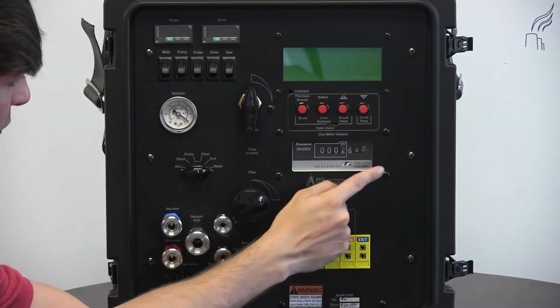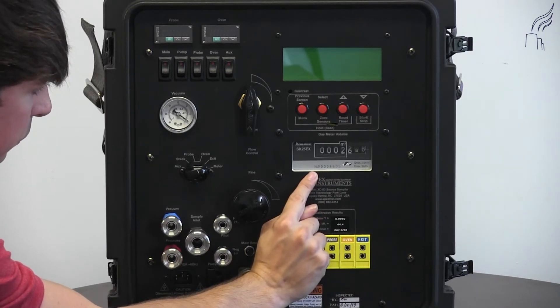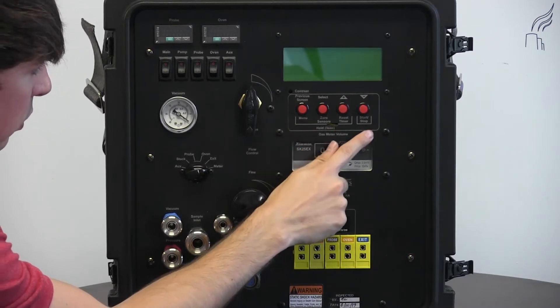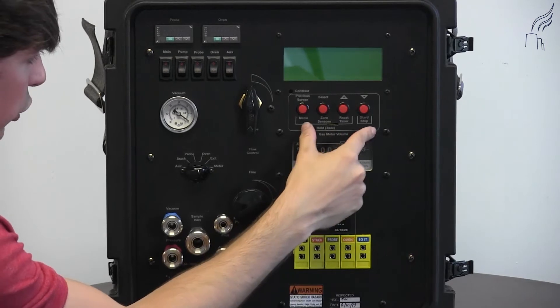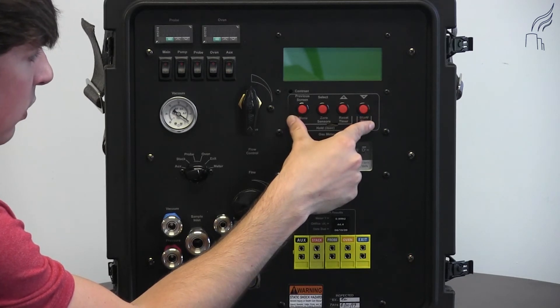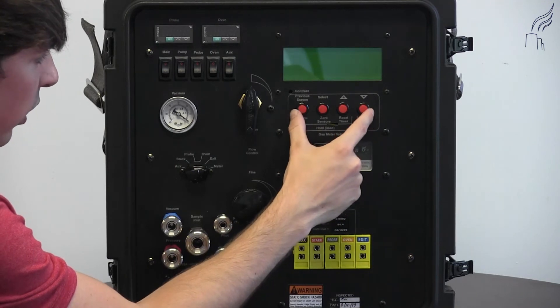Moving up, we have an analog dry gas meter display. Further up on this console, we have buttons. In models moving forward, membrane switches will be in the place of these buttons. These membrane switches have lower maintenance and are more reliable than the buttons, so these are replaced.